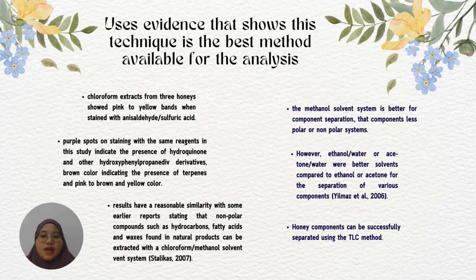The results have a reasonable similarity with some earlier reports stating that non-polar compounds such as hydrocarbons, fatty acids, and wax found in natural products can be extracted with a chloroform or methanol solvent system.